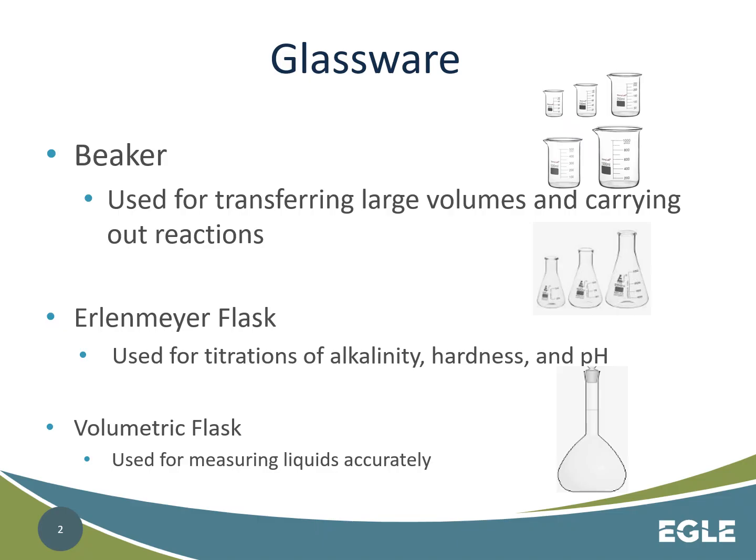Another thing is, these are glass. They can drop, they can break. So there are cut hazards associated with this too. And another thing about glassware is that sometimes there may be dry residual chemicals on the glassware, and when you're going to use it for titration or some sort of chemical reaction, there could be alternative reactions that occur and cause harm to an individual due to different gases that may be released, heat that might happen, explosions that could happen, and such along those lines. So just keep all those safety things in mind when using various glassware throughout your laboratory.